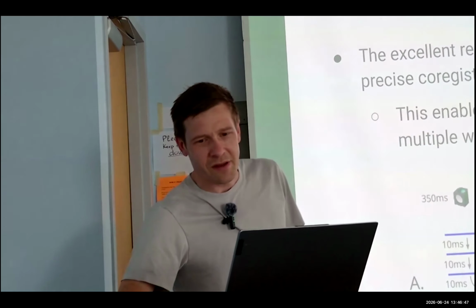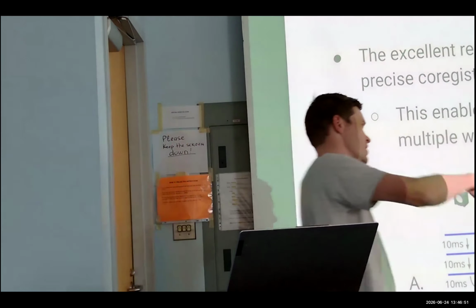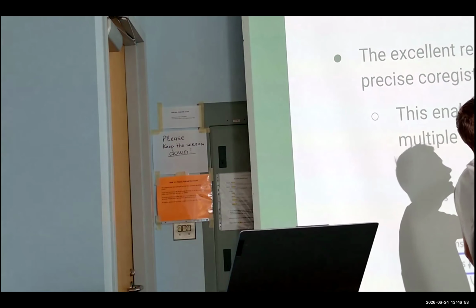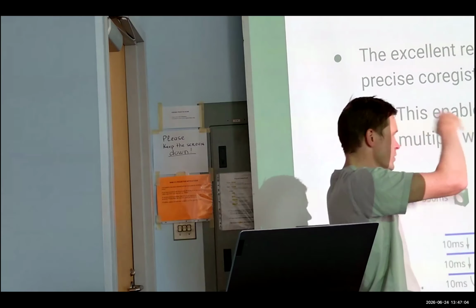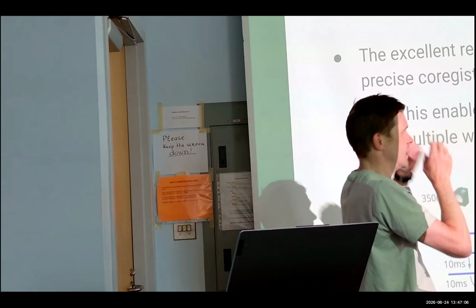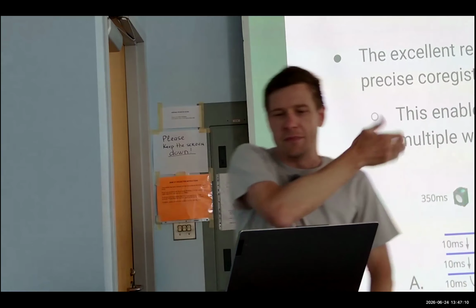If I don't have that repeatability and I have to do each position at a different wavelength, now I'm doing 3 filter changes per position instead of 3 across the whole set. And you can see that even just for those 9 images, hypothetically here, we're taking basically 3 times longer because of that.